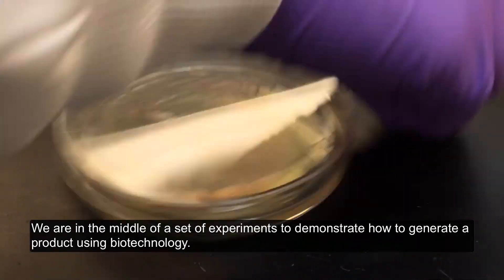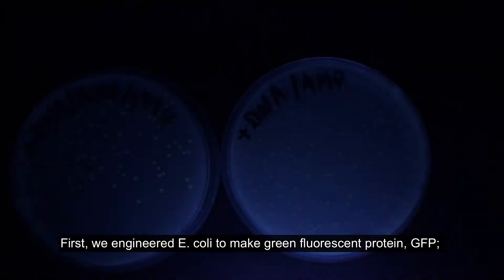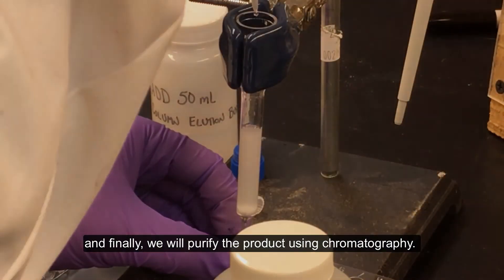We are in the middle of a set of experiments to demonstrate how to generate a product using biotechnology. First, we engineered E. coli to make green fluorescent protein, GFP. Next, we will scale up production using cell culture, and finally we will purify the product using chromatography.